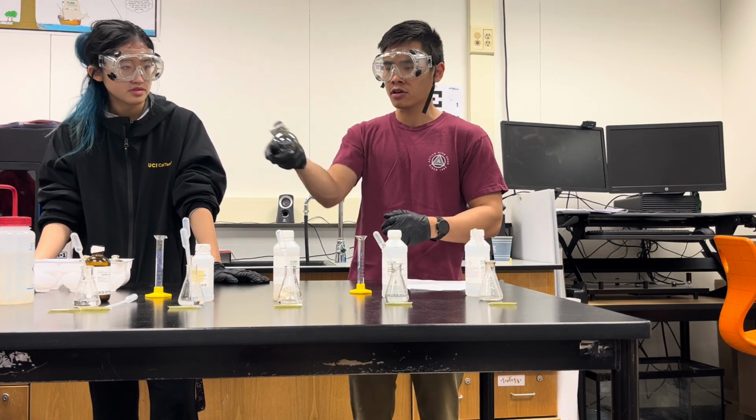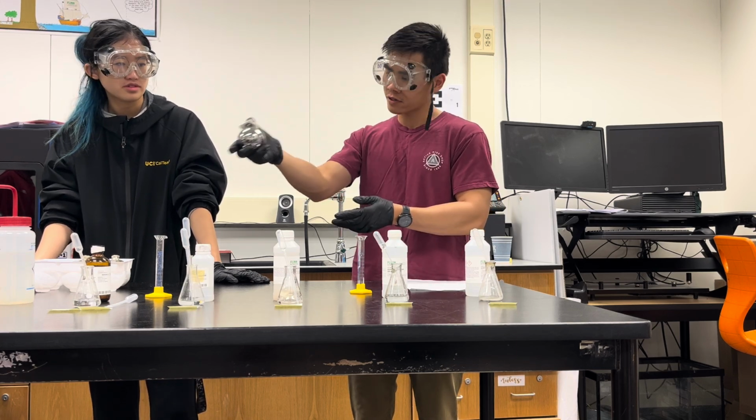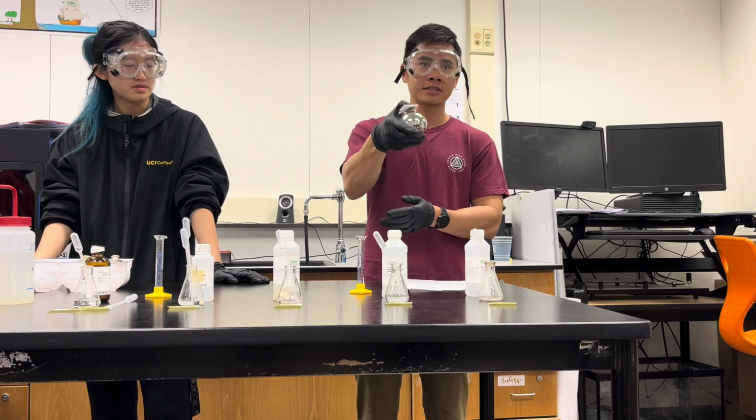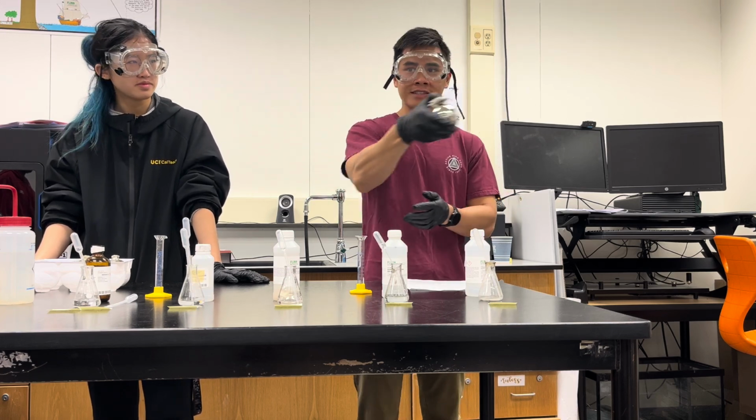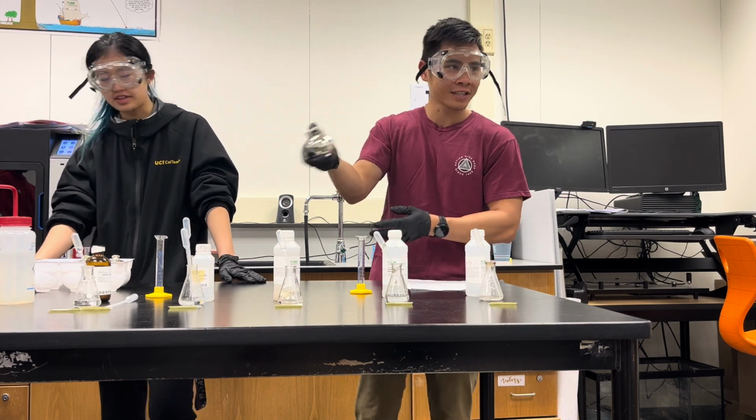And you can actually start to see the color change. Oh, that's it. Oh, happening right in front of you. What? So that's spooky. For a second, it's already silver. I know, right? So if you blink, you miss it.